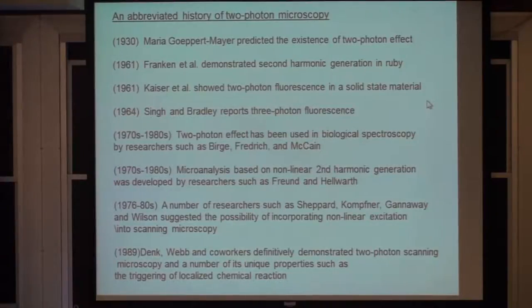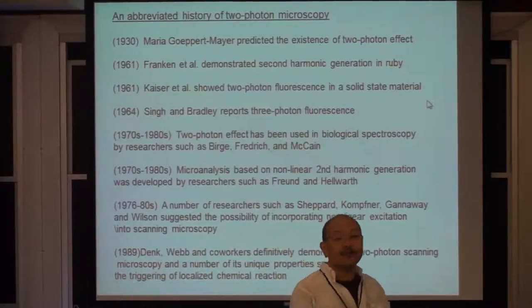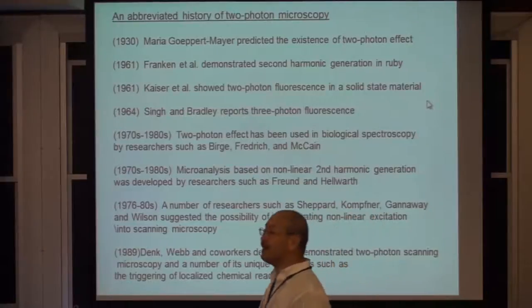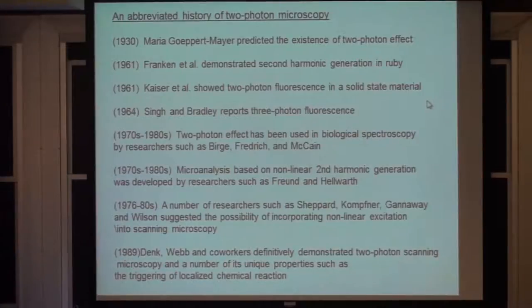That was when Dr. Winfried Denk and Dr. Watt Webb at Cornell University, with the invention of the titanium sapphire laser and other femtosecond laser sources, demonstrated the first two-photon imaging in 3D of a biological specimen. Very importantly, this paper was published in Science and caught the attention of almost everybody, including my postdoc advisor at the time, who said, Peter, why don't you go to Webb's lab and learn how to do two-photon? I said, sounds like a good idea. And I think that in the long run, it was a good idea.